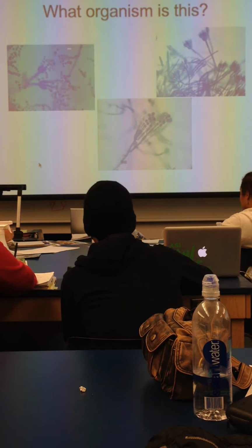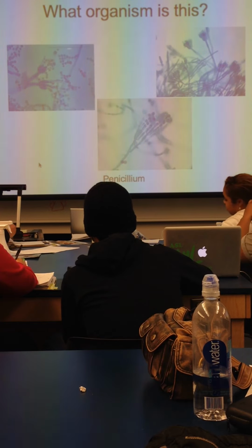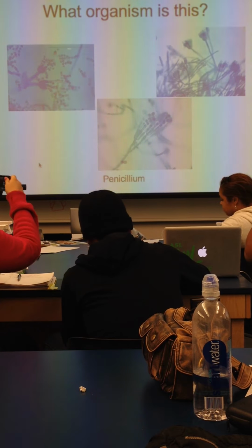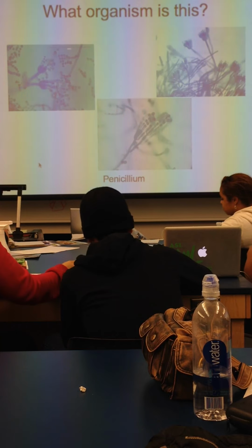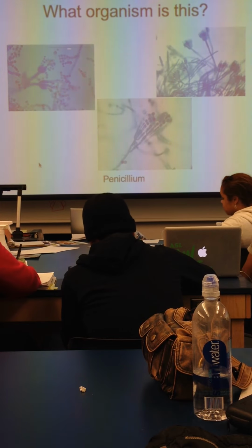Okay. What organism is this? Penicillium. And what kingdom does Penicillium belong to? Fungi. Good. Okay. So we have the hyphae.